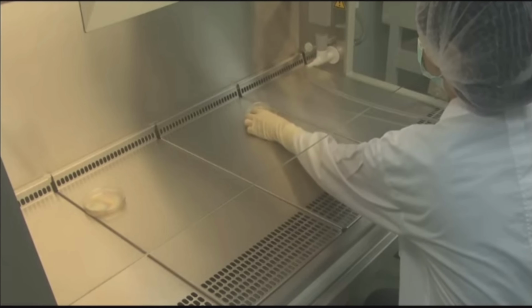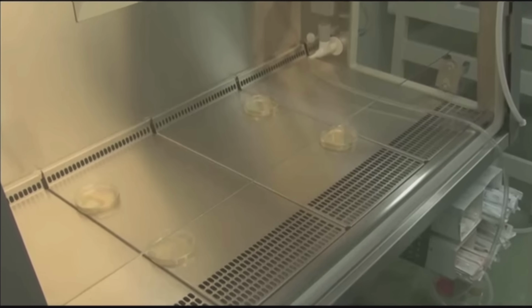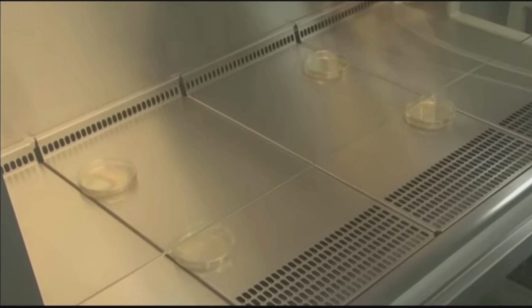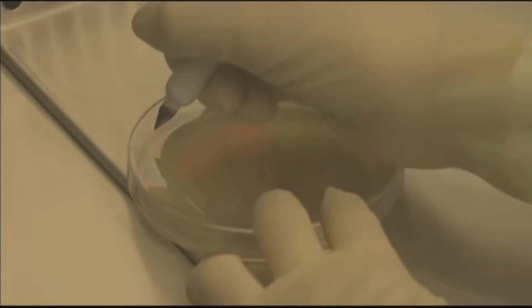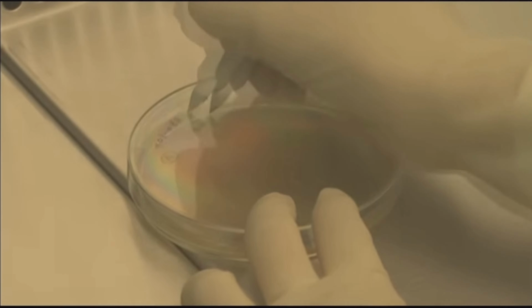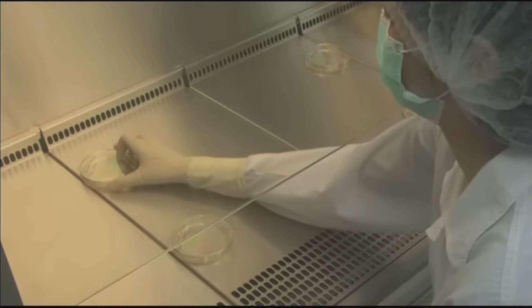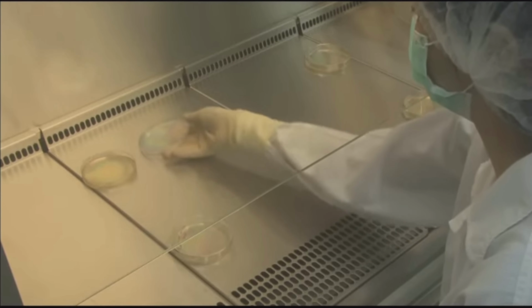You need to ensure that your culture dishes are placed evenly in the biosafety cabinet. There should be 4 dishes for a 4-foot cabinet or 6 dishes for a 6-foot cabinet. Mark the biosafety cabinet number, followed by the date, site as well as the timing on the Petri plates.